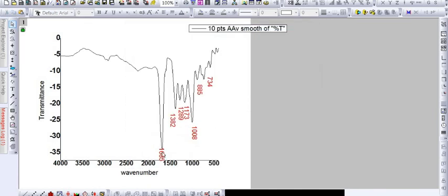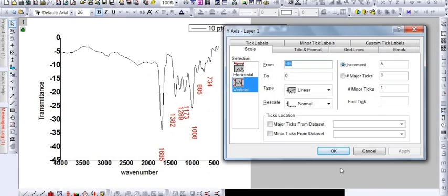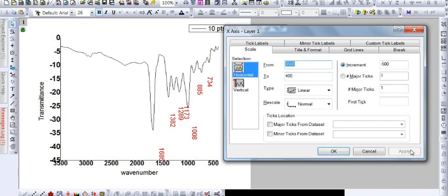Now let us add some small lines, and let me also increase the scale so that the values can easily be seen. Now it is much better, and let me reduce the scale on the x-axis to 3500.